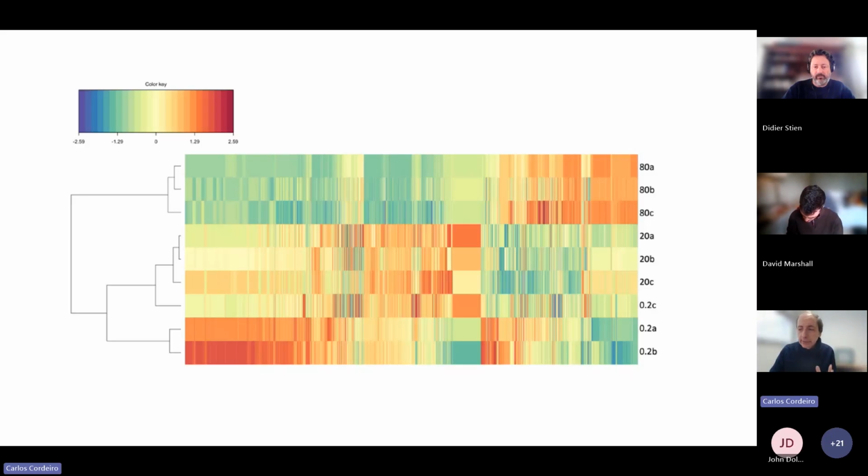So one of the advantages of using mass spectrometry is that you are ionizing everything at the same time. Of course, you have suppression effects. You don't see everything, but you see a vast diversity of chemical composition that is not affected by the biases that are introduced by chromatographic separation. So you do have a representation of just about everything in the metabolism. Sometimes you have pathways that are better represented than others. That is a work in progress. Maybe one day we will have a single shot where we actually see everything at the same time.